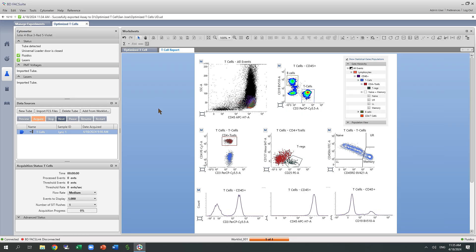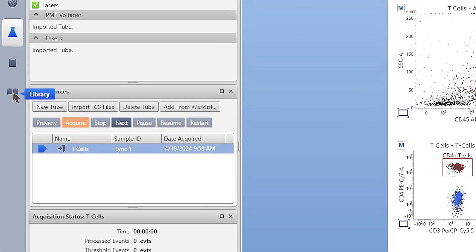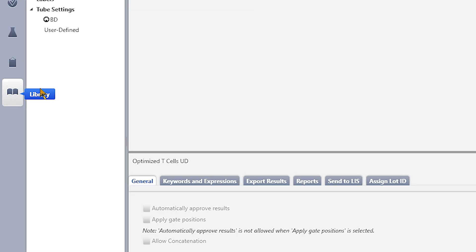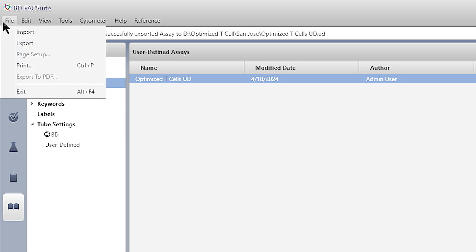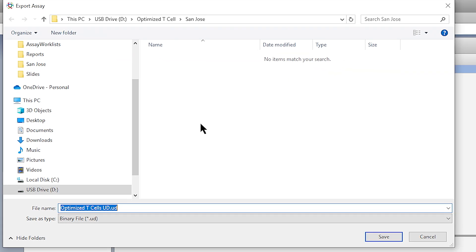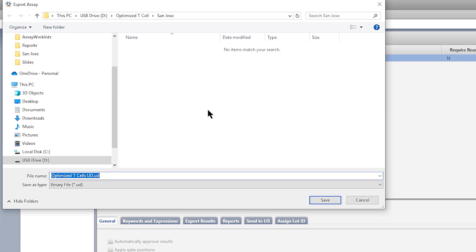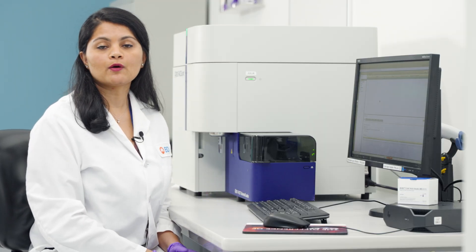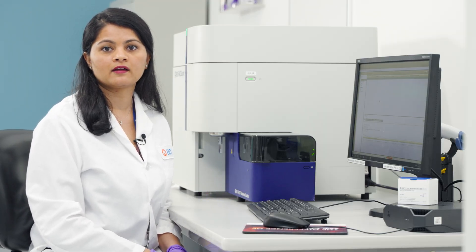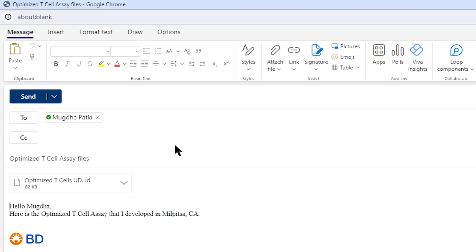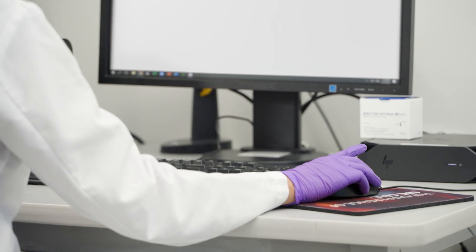Now that I'm ready to transfer this assay, I go to the library, find the assay that I want to transfer, go to file, and export it to the folder where I want to save. Now I'm ready to electronically share my assay via email or a shared network with my colleague.